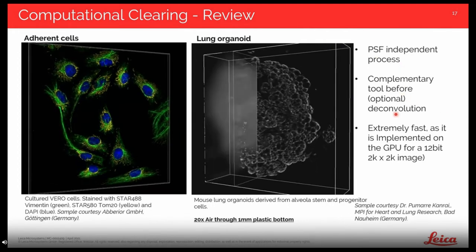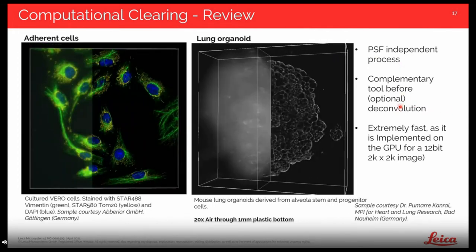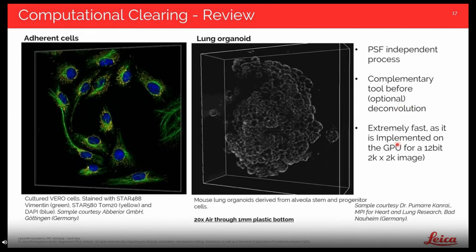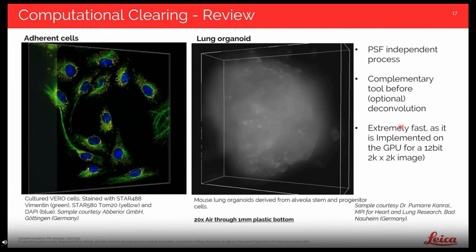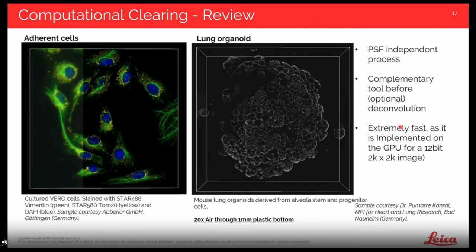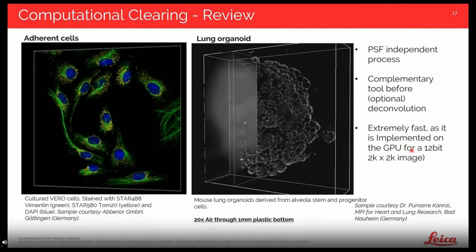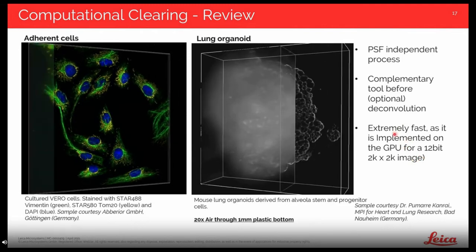It's complementary to your workflow and does have optional deconvolution, which will be discussed in the next portion. It's meant to be extremely fast, meaning we have that instant computational clearing. It's implemented on the GPU. You get your data instantly with acquisition.